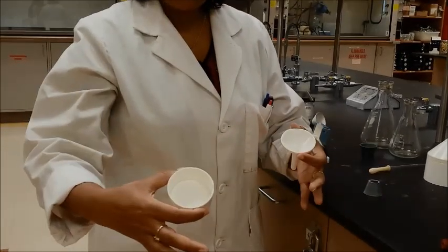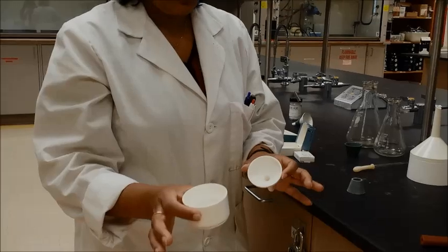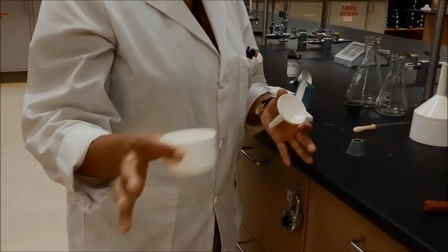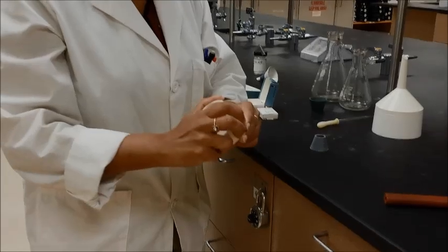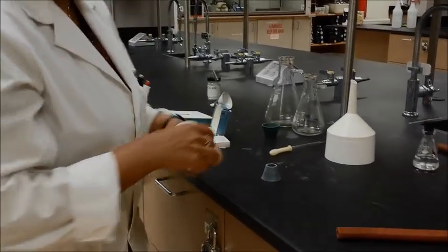So, you have a funnel also, then you have this little piece of the Buchner funnel, which, in case you want to weigh separately, you can actually do this. So, this one separates out, so be very careful when you're working with these kinds of Buchner funnel.